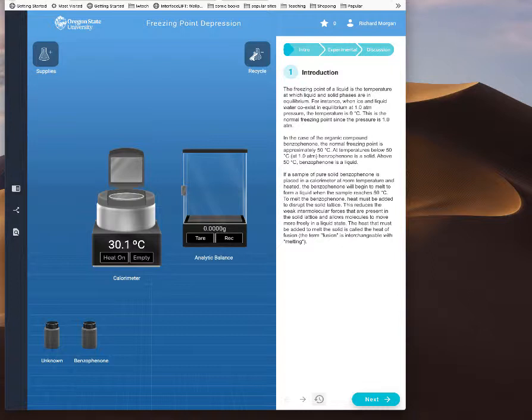That's problematic for salts and things that don't dissolve the way we want them to, but anyway, this is how you do it. I'll take you through a little bit of getting the data and a little bit of calculation. So this talks about it a little bit.